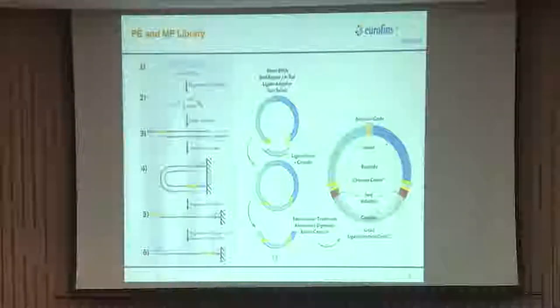And the amplification is in thousands, and that amplification happens and then we have a read. So this is your forward read and this is your reverse read. This is how the reads are generated, right? So there are two adapters, P5 and P7. Based on that, the forward read and the reverse read are generated. So this is how paired end chemistry works.